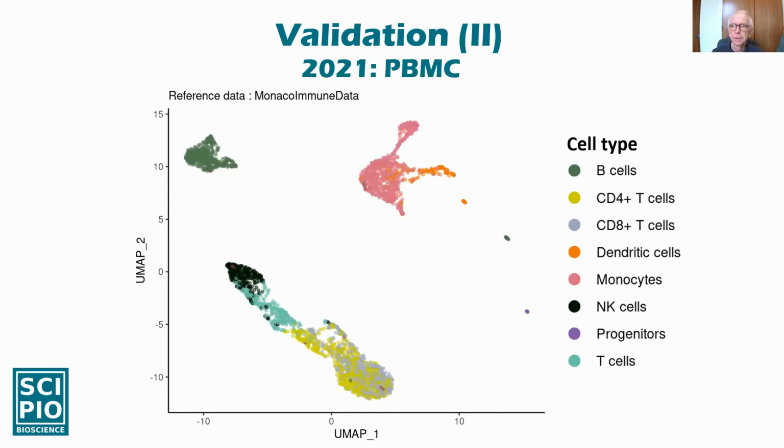The other standard kinds of tests that we can do are looking at PBMC cells, and here we can do a typical clustering analysis, and we see that we've managed to separate the different cell types that are listed on the right very well. B cells here are quite far separated from monocytes, and we can see families of T cells where there is also quite good resolution.